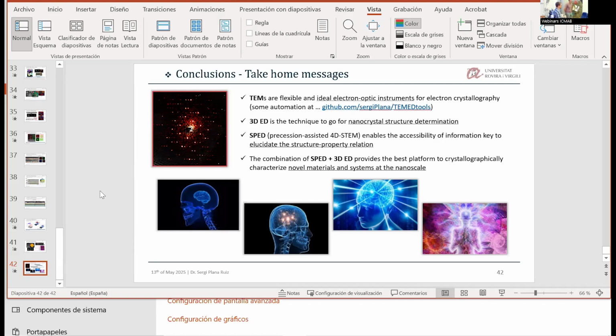That's the problem. Nevertheless, nowadays there are exotic things. There are magnetic lenses that do not have a magnetic field in the sample, and you can go to atomic resolution in STEM. There is only one maybe in the world, but it's coming. The first and unique so far is the one in Japan, but I think in the US there are two centers.